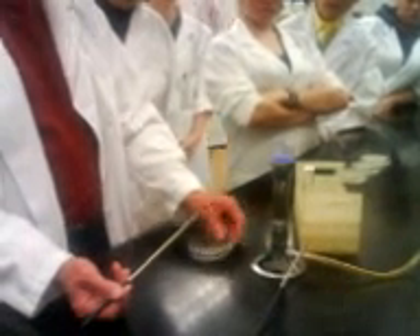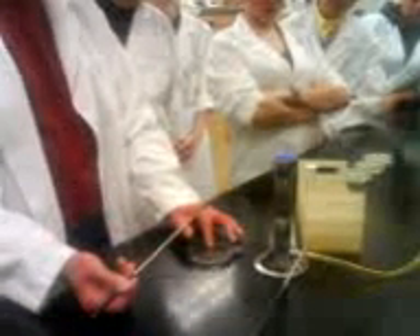You can either work with the plate upside down, as I've shown you before, or if you want, initially you can work with it right side up and work on the bench. I prefer this method because I can work closer to the flame.